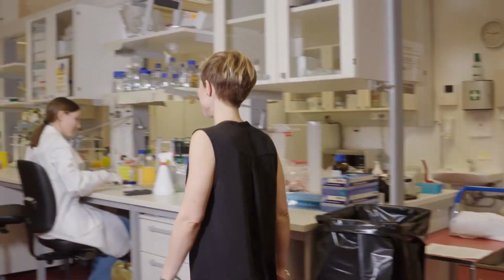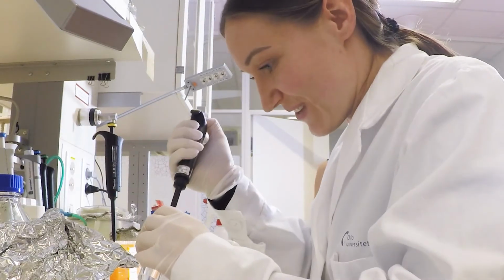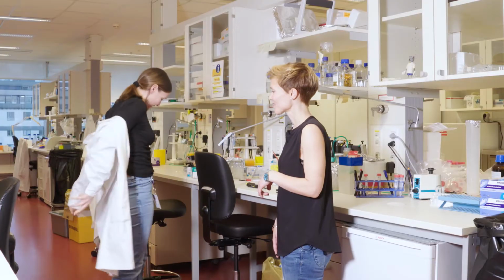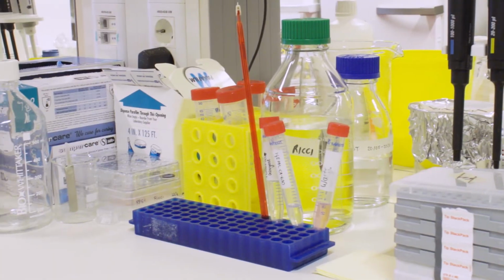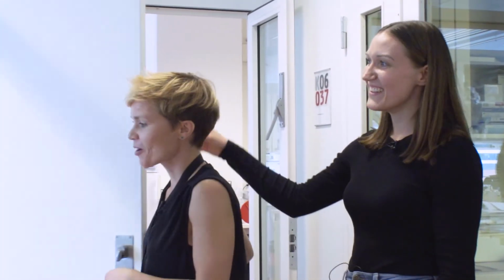Hi, Ricci. Hey. You ready to go and look at some flies? Yes. So now we're going to go in the fly room. You know this room really well, yes, since you flip the flies all the time. Hours and hours.